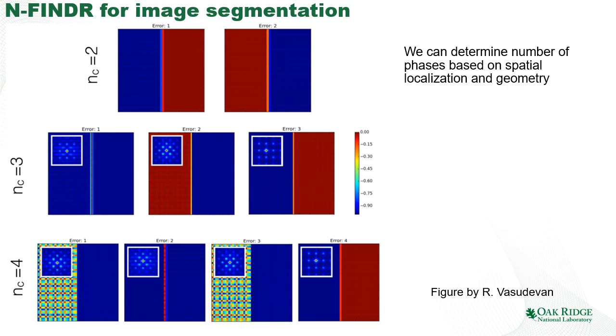And you can see how the Fourier transforms look in this interface component, the first component and the second component. And if we insist, for example, we tell the algorithm that there should be four components, in this case we still have one component and we have the interface, but then the algorithm tries to separate one of the components into subcomponents, and you can see that it doesn't look very good.